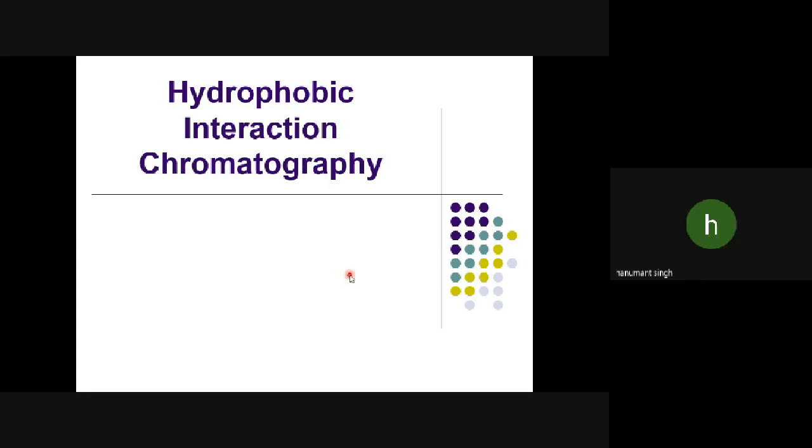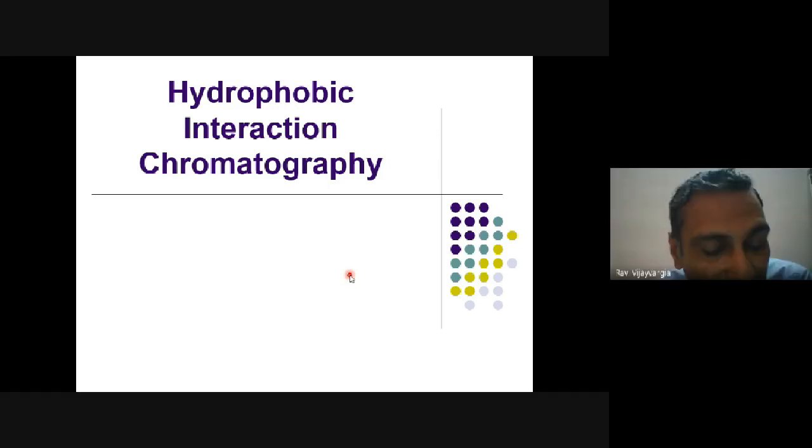Actually, sir, sometimes we do not have much idea about some substance when we isolate it and want to purify it. So in that time, ligand preparation to separate it out is sometimes very difficult. See, another way is to use some bioinformatics tools to find out what can potentially interact with your molecule of interest. So sometimes bioinformatics might help you to identify a potential binding partner for it.